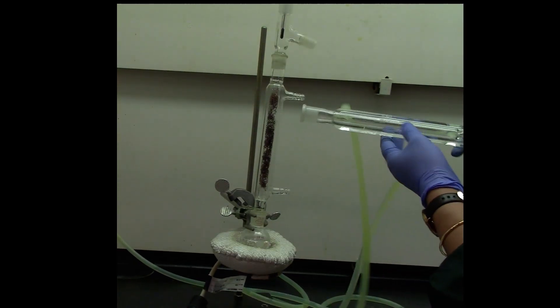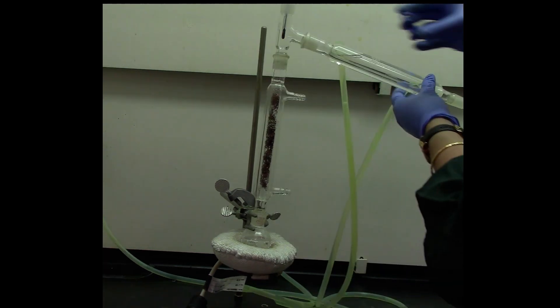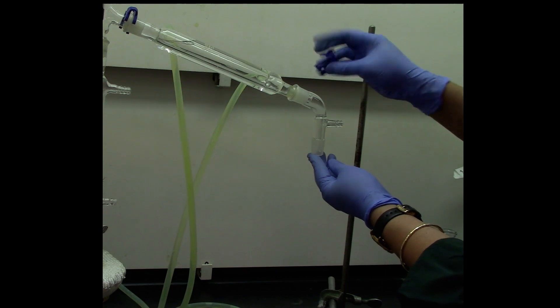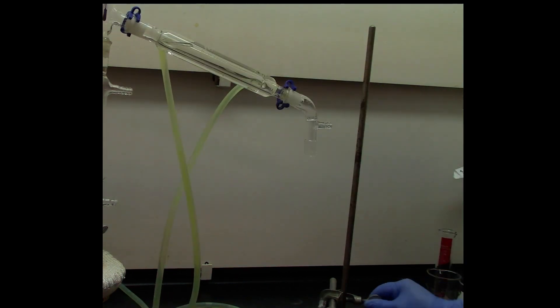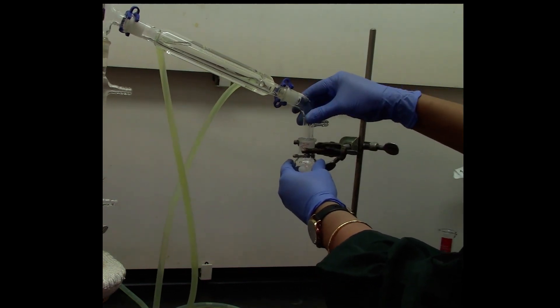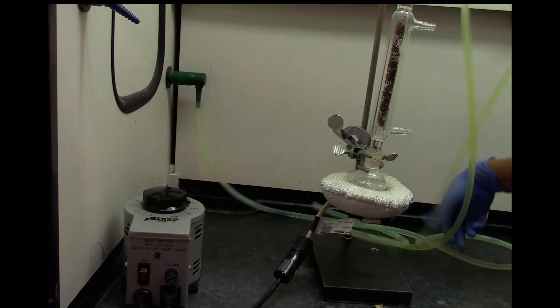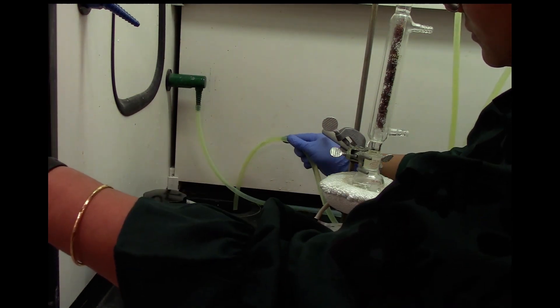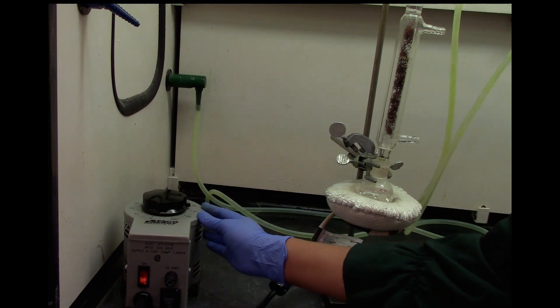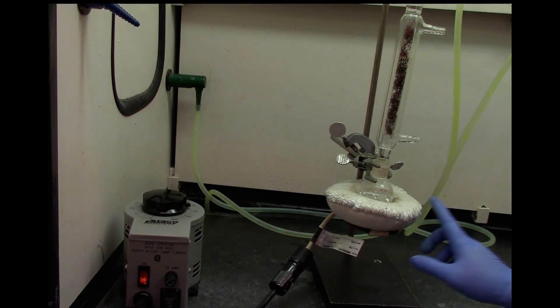Now we are going to connect a condenser with the water connection right here. Make sure to use a keg clamp. At the end, another keg clamp holding the vacuum adapter. Now we are going to put the collection flask at the end of the vacuum adapter. Make sure to turn on the water, then turn on the variac. Put the variac between 70–80% and wait for the mixture to start boiling and distilling.